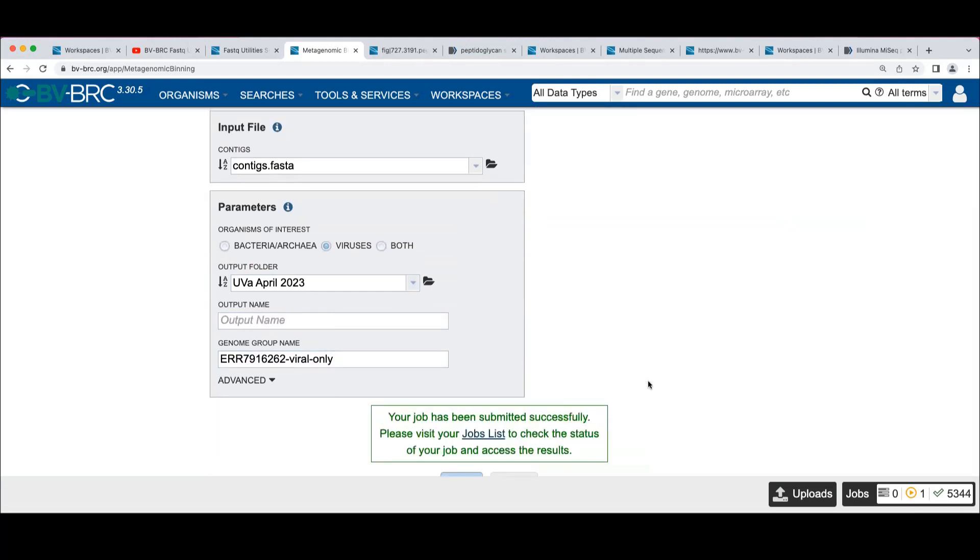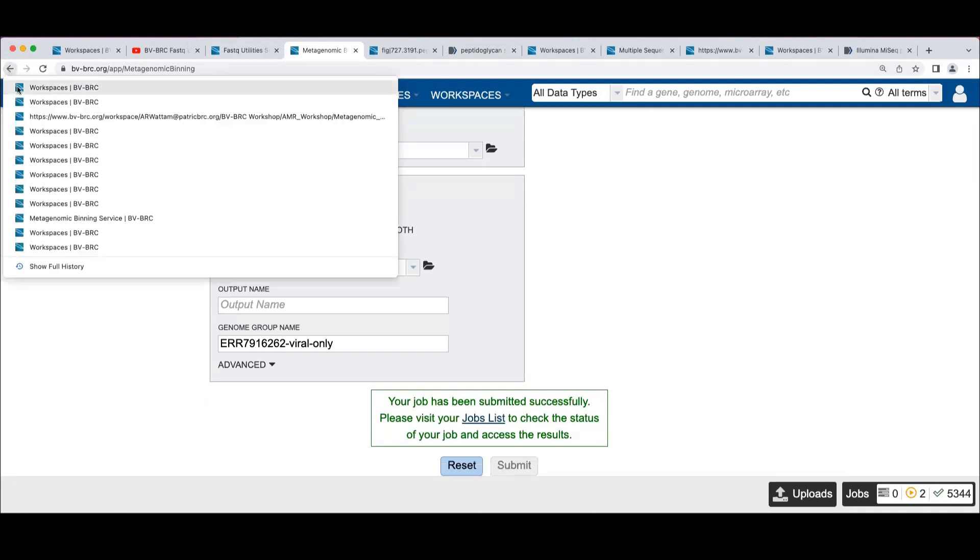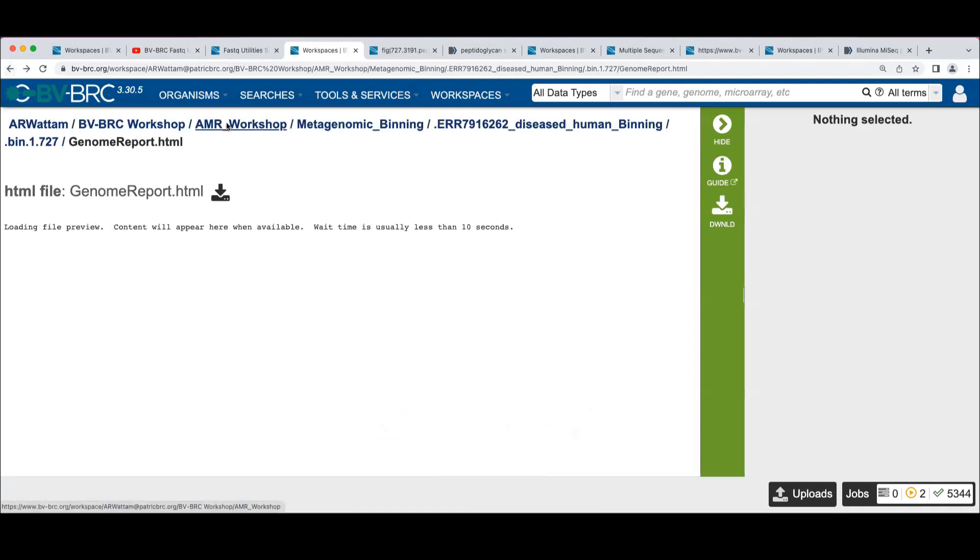So what this is going to do is start with this contigs file and do just a viral binning. Once you've got the assembled data, the binning runs typically pretty quickly. Again, if you've got a monster dataset, it's going to take a while, but much faster than the assembly part of the job.